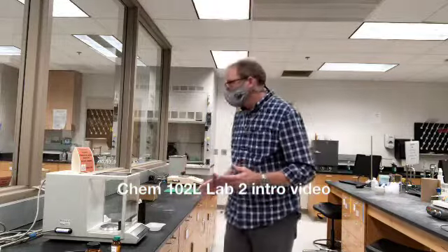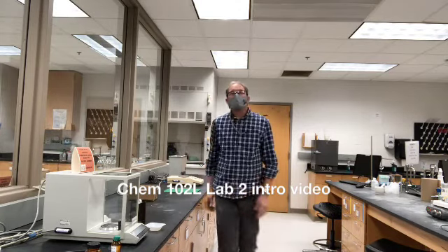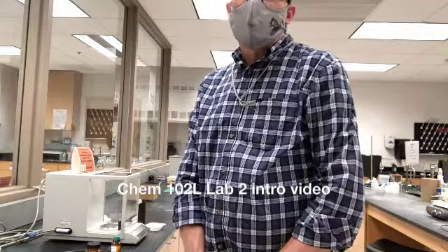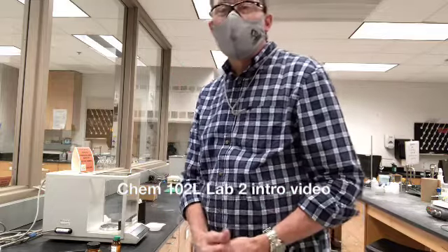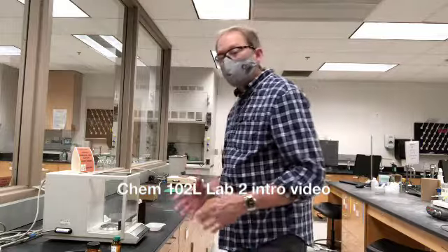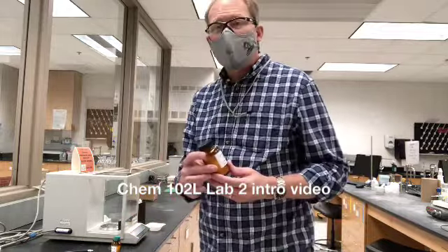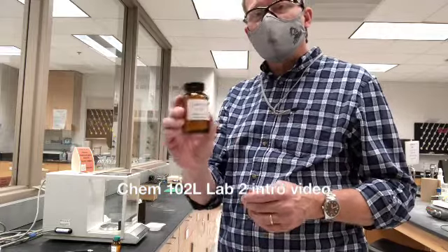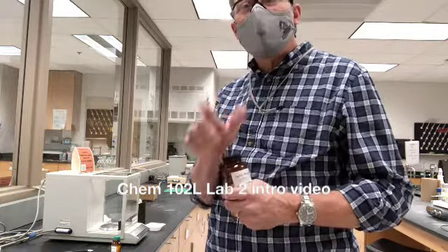And I'll walk a little further away. We have over here a second balance. This balance is what we call a top loader balance, and it's good to the nearest hundredth of a gram. So it only has 2 places after the decimal place, but it's obviously easier to use since it doesn't have the doors constraining the space. It's less sensitive to currents in the lab, and so it doesn't need doors. And so I'm going to just describe a way that you can measure out a certain amount of this lauric acid, and how we can combine these 2 balances to do this really very easily and very accurately.